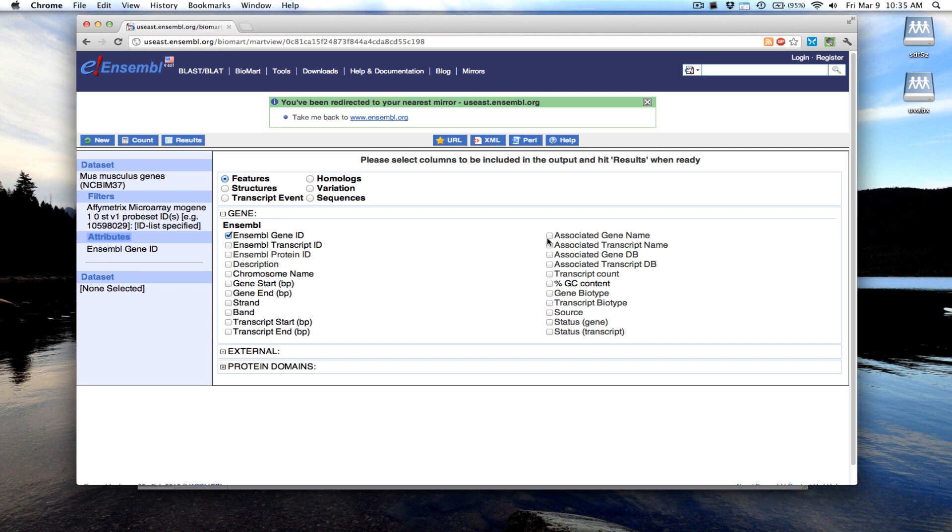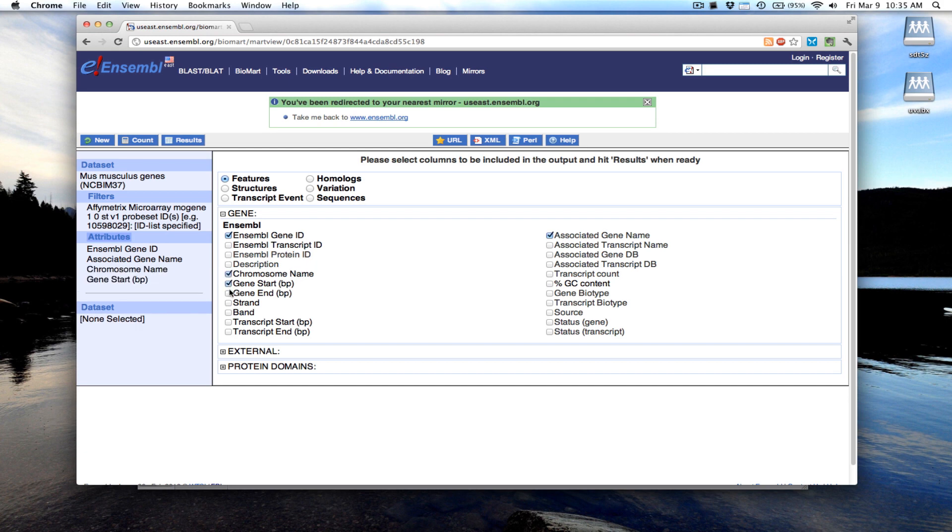Maybe I want the gene name, the chromosome start and end position, maybe the description, the long name of the gene.